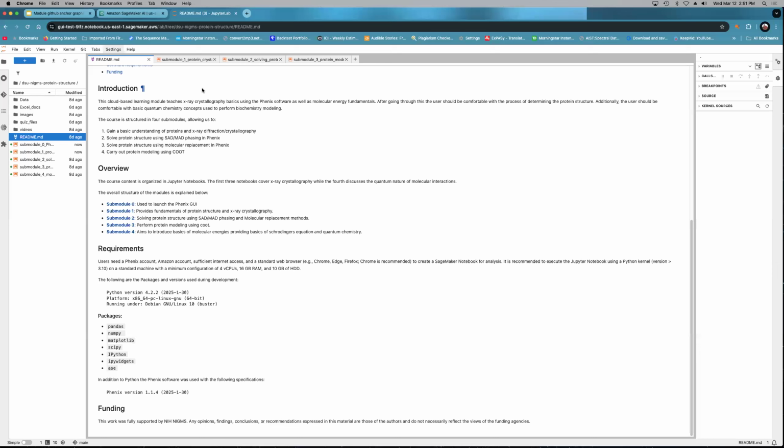So if you collect data, you should have some idea on how to deal with it. Also, when looking at structures downloaded from the PDB, you'll have familiarity with the software that's used to visualize them. And that's very helpful too. It's something you can do all the time, is check and work with what other people have done. And you'll have a better handle on how to look at things like electron density maps, what you're actually seeing.